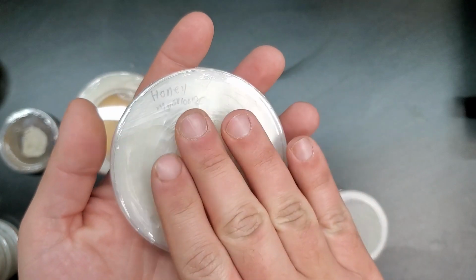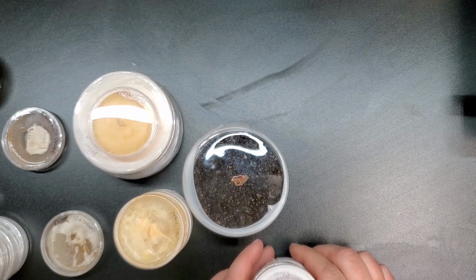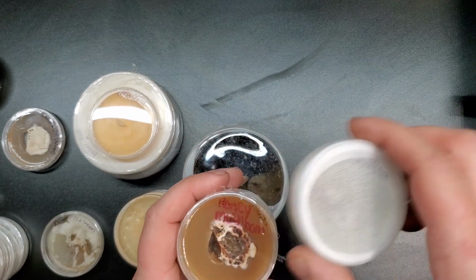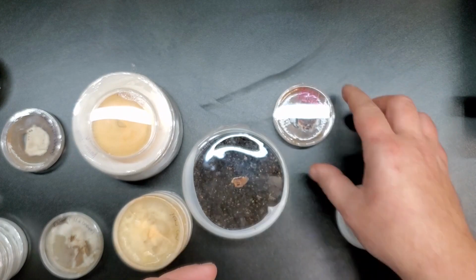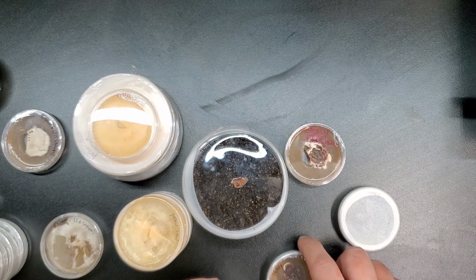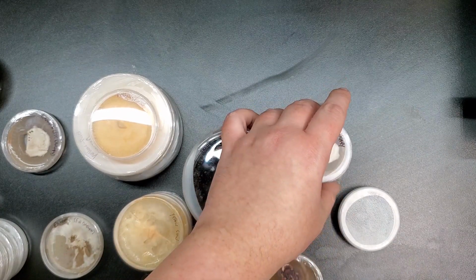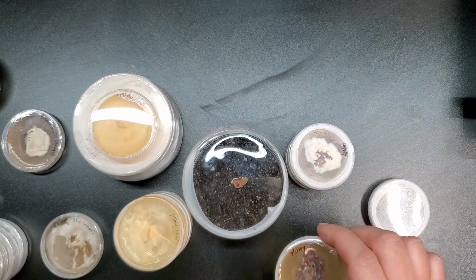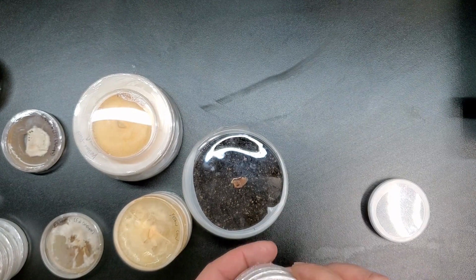But this one is for the sole purpose of keeping in my lab fridge for my culture collection. Here are all of the small honey mushroom petri dishes. This was one of the original ones right here. Yep, and there's another one of the original ones, and another one. I think this may have been one of the original ones too. I did 4. None of them got contaminated.